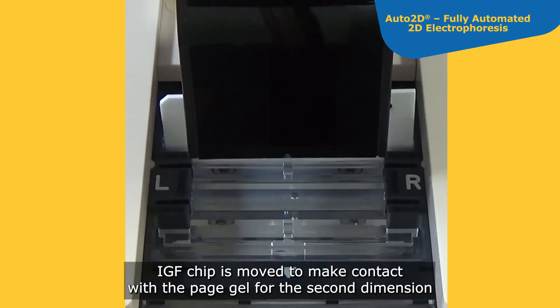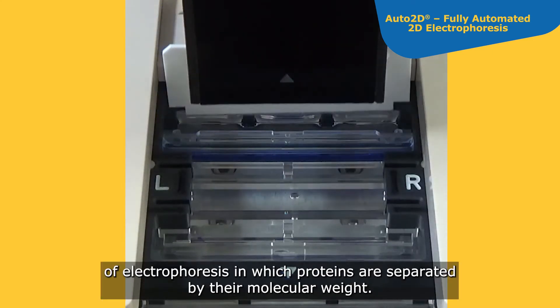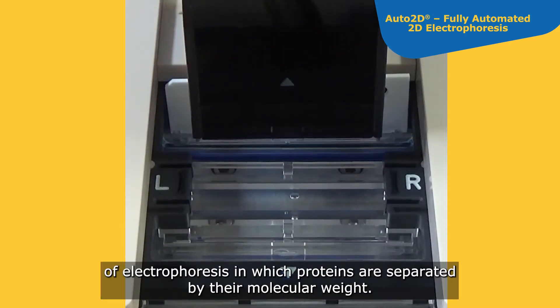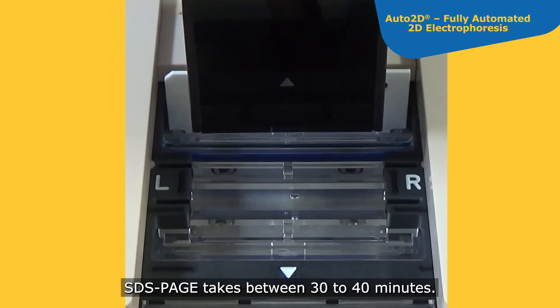Finally, the IEF chip is moved to make contact with the PAGE gel for the second dimension of electrophoresis, in which proteins are separated by their molecular weight. SDS-PAGE takes between 30 to 40 minutes.